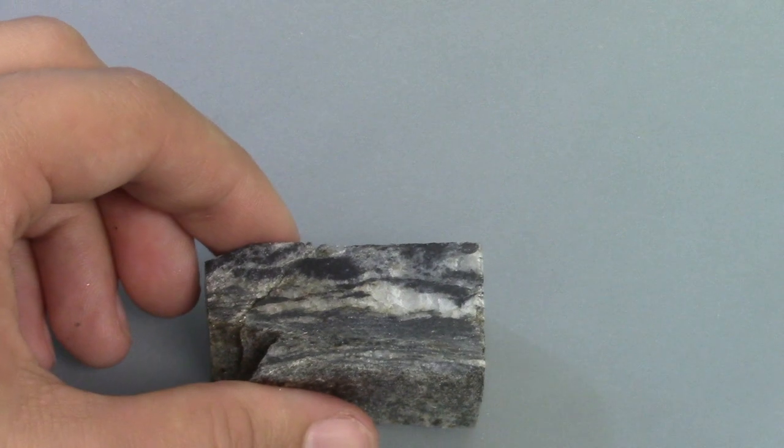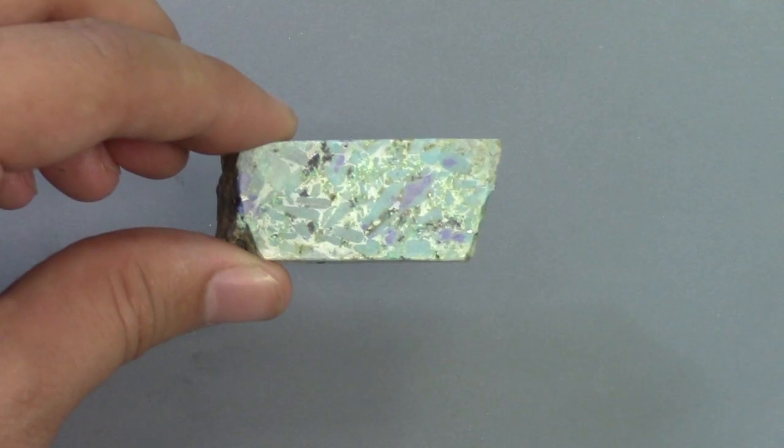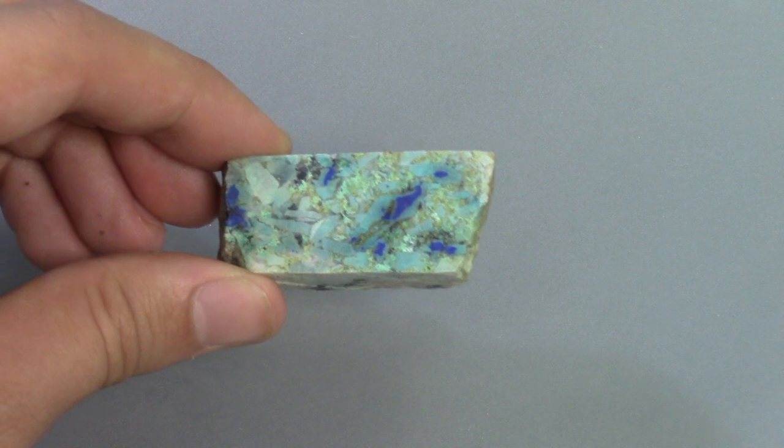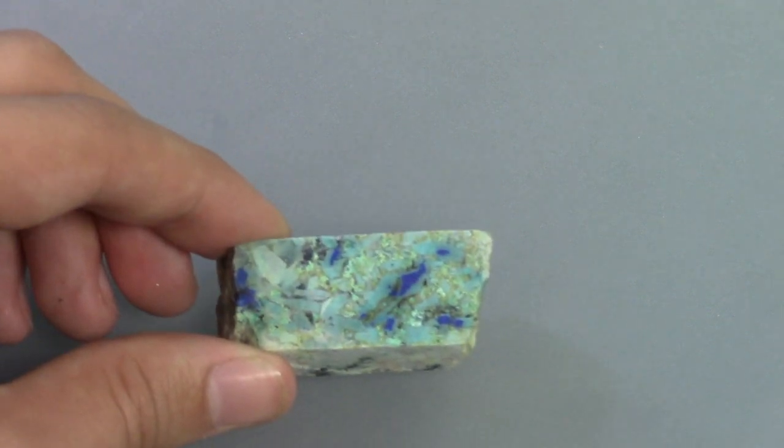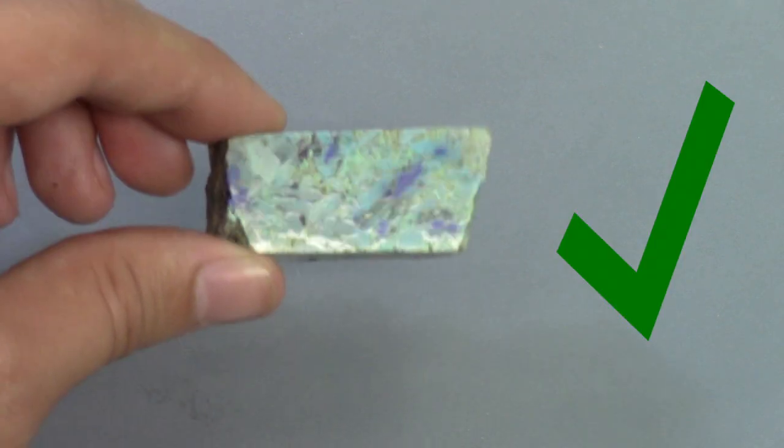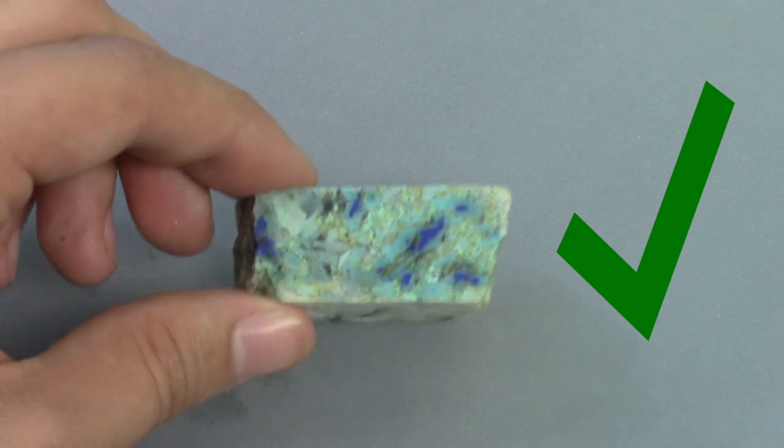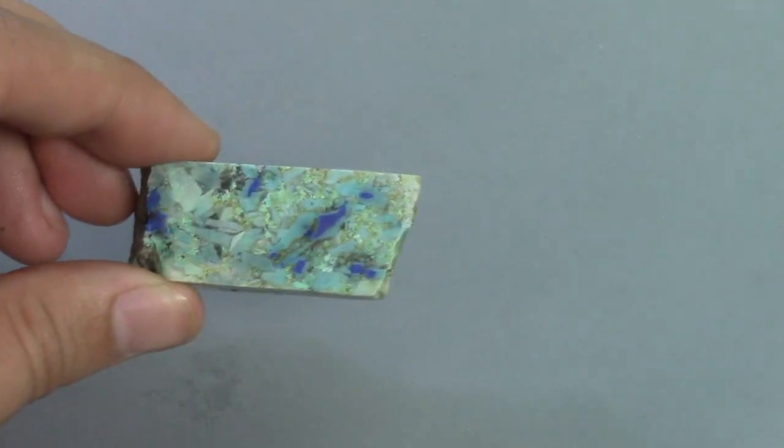Cracks are okay. Sometimes we can't do anything because that's what's in the rock. Some minerals may be more reflective than others when you polish the sample and that's okay. But you should, as much as possible, try to see the surface being flat.